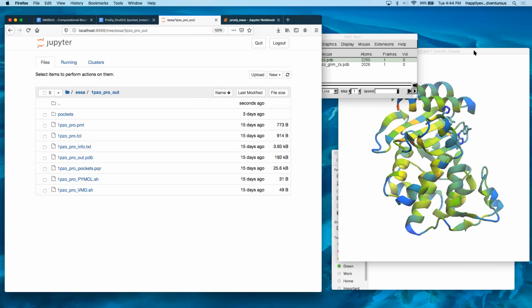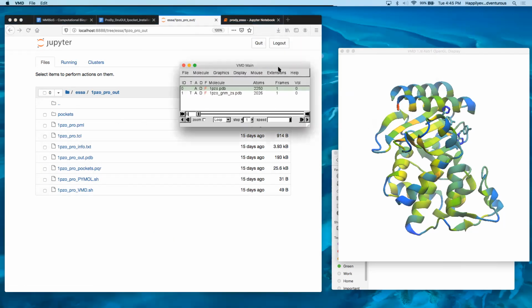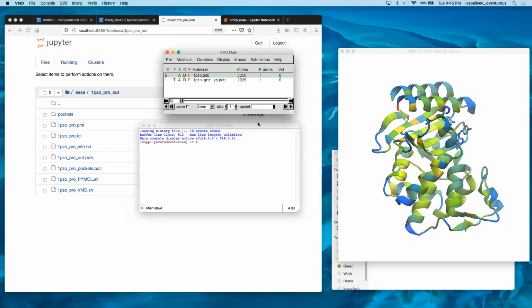As you know, VMD uses TCL, and that's why I'm going to run this one, okay? So I need to come here and then choose Tk Console, okay? Is everybody with me till now?